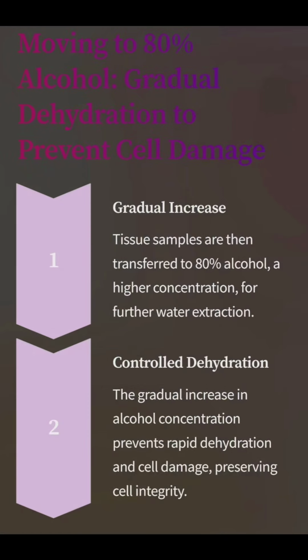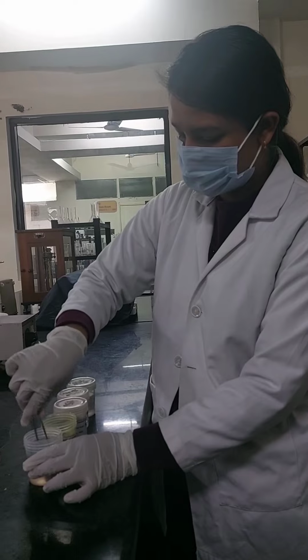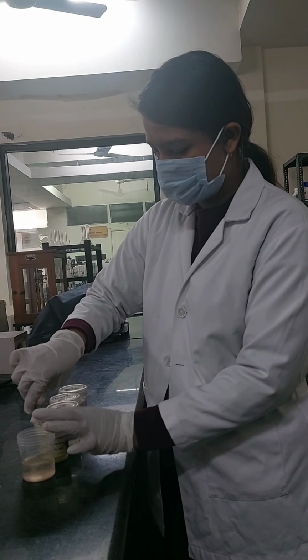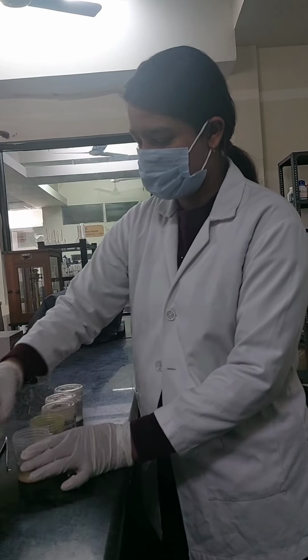The next step involves further immersion of the tissue sample in 80% alcohol. After 1 hour, the tissue sample is removed from 70% alcohol and added in 80% alcohol.